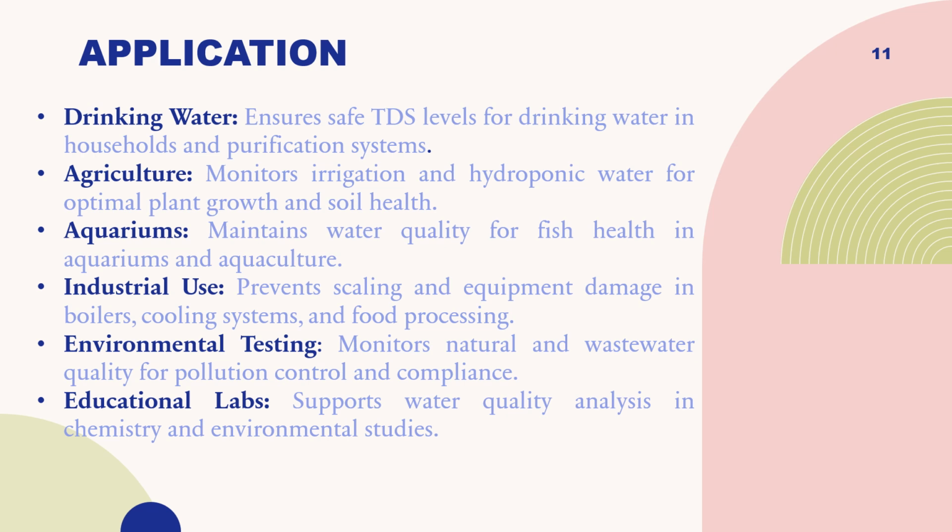Then, educational labs. It supports water quality analysis in chemistry and environmental studies. In educational labs, TDS is also important as there are many scientists doing research, so they need distilled water or water with the proper TDS. So in that system, the TDS meter plays an important role.